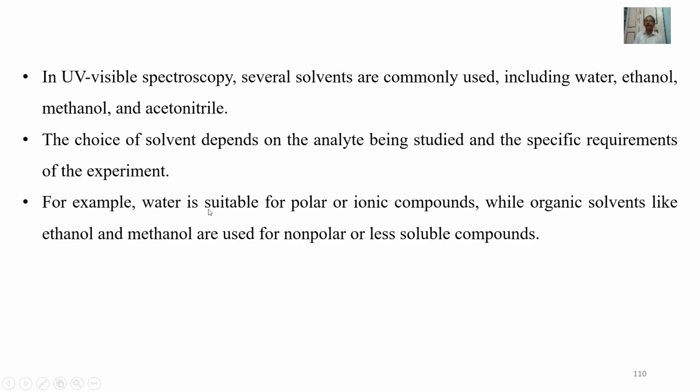For example, water is suitable for polar or ionic compounds, while organic solvents like ethanol and methanol are used for nonpolar or less soluble compounds. And the polar components will show red shift, whereas non-polar components will show blue shifts.